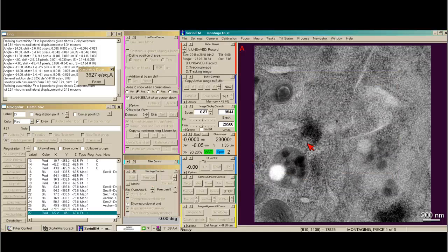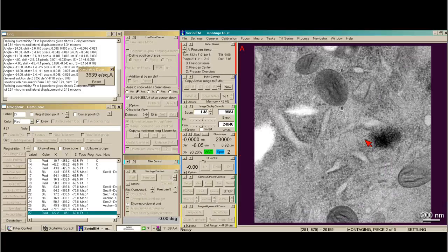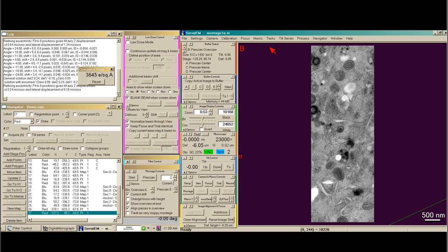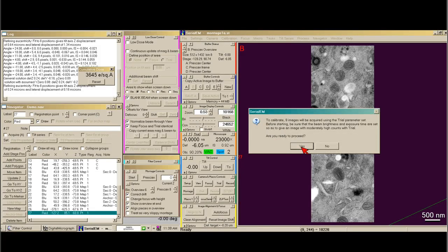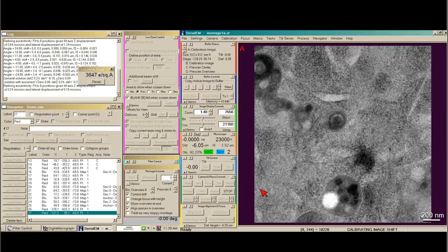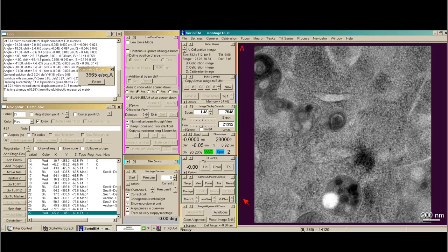I'll just take a pre-scan. I'm going to right-click and drag that a little bit to re-center, then take a new pre-scan. Now, sometimes if you haven't tried to take a montage at this magnification, it will ask you to calibrate the image shift. I'll show you how that works. You say Calibration, Image Shift. It takes trial images. Then it gives you an indication of how well it went, and we say OK. Now we're ready to do another pre-scan and double-check that everything is centered how we like it.